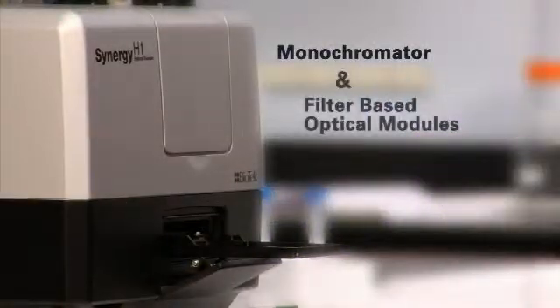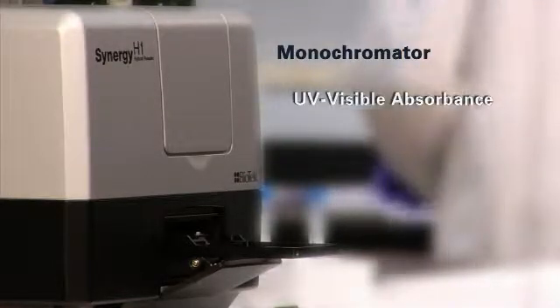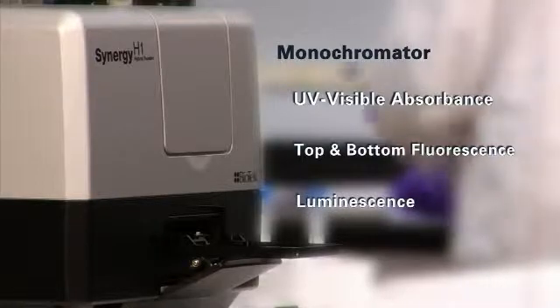Two optical systems are available: monochromator and filter-based optical modules. The monochromator-based module supports UV-visible absorbance, top and bottom fluorescence, and luminescence.